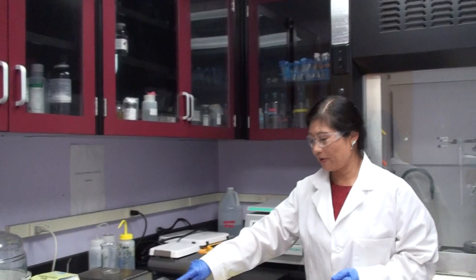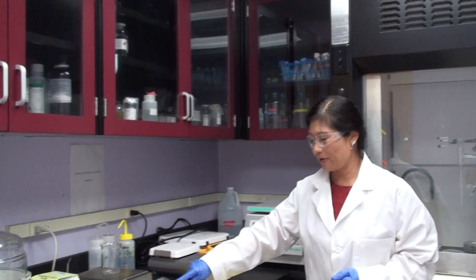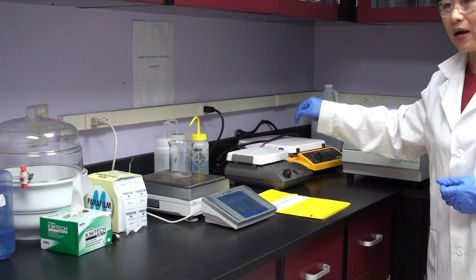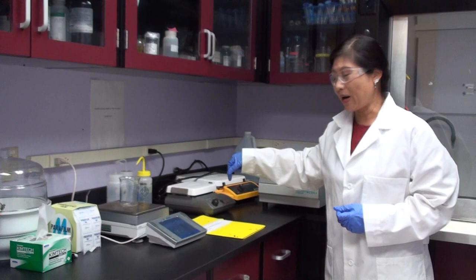And we do have another scale here to test the core sample, and we do have a magnetic tank with stirring. You can put one liquid, mix another liquid, and stir and mix it by this equipment.